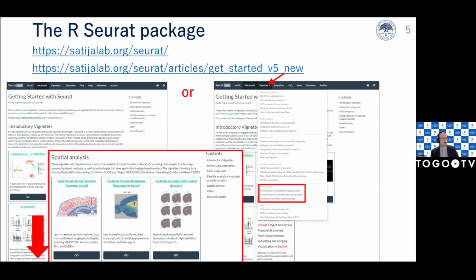So I think some of you will be familiar with single cell data analysis. And as Dr. Sakai just said, some of the analysis tools that we use for spatial data analysis were originally made for single cell data analysis. And one of them, maybe the most famous package for this, is called Seurat. And so I will use this as a basis for my presentation here.